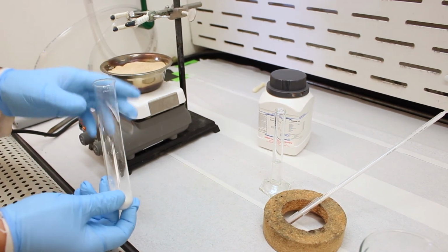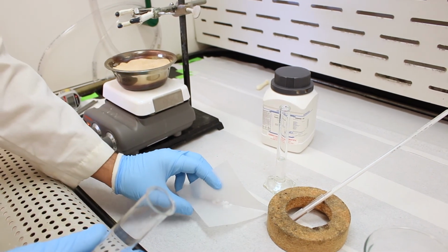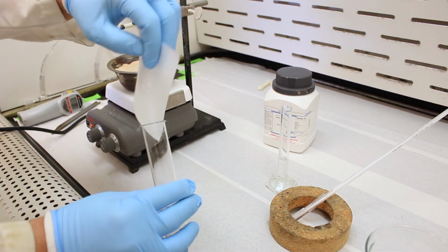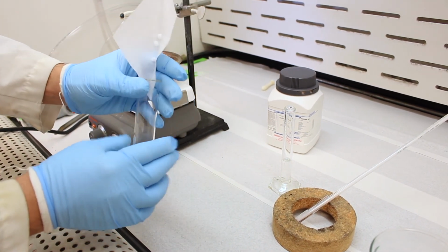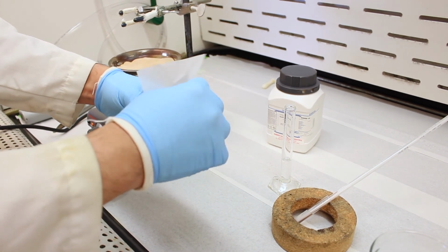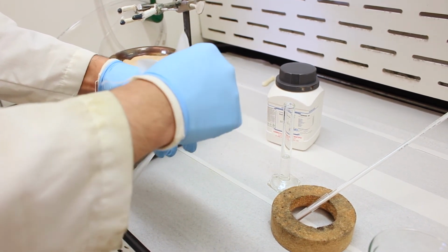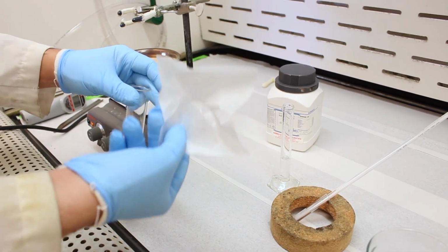There's 1 gram of it in here. And the other reagent we need is some sodium hydroxide. So this is about 6 or 7 pellets of sodium hydroxide. It's important that we try to get it in there. This substance absorbs water very quickly from the air. Very important that we try to get it into the vessel as quickly as possible. See, it was already absorbing water.